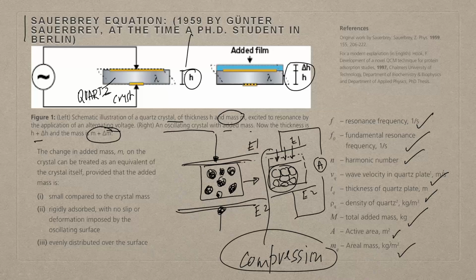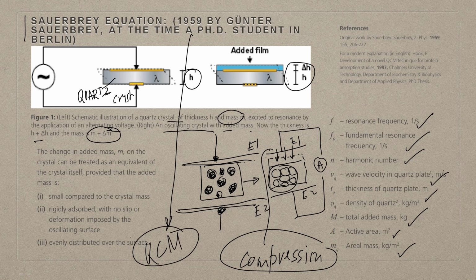So, this is the beauty of piezoelectric material, and using quartz crystal for measurements of weight in terms of frequency was the PhD thesis of Gunther Sauerbrey in 1959. Based on that principle, what we today talk about, QCM, quartz crystal microbalance, has been developed.